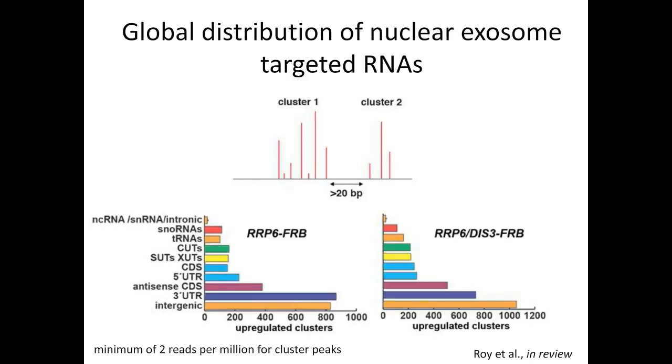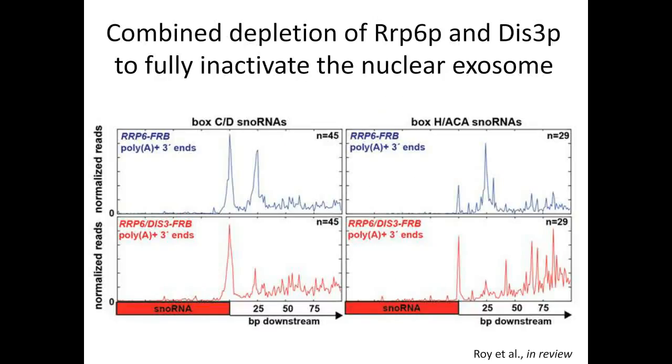When we looked at where these clusters were mapping, we noticed that most of them were mapping in 3' UTR and intergenic regions. And when we fully inactivated the nuclear exosome by depleting both subunits, the intergenic region clusters were the most increased, along with regions that were previously known to be targeted by the nuclear exosome. The fact that we identified clusters in intergenic regions, in regions that weren't previously known to have transcripts, led us to believe that the QuantSeq method was giving us unprecedented resolution in identifying the transcription that leads to degradation.